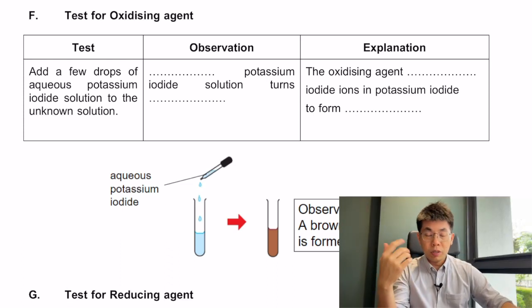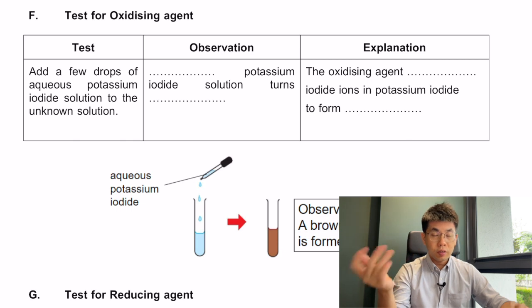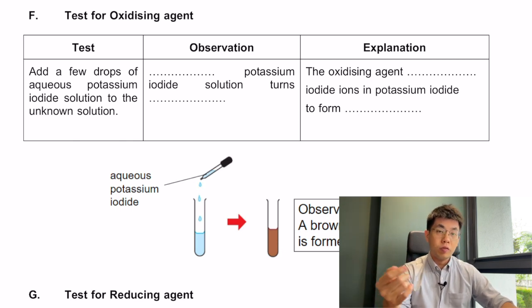Hi everyone, Mr. Benjamin here, and today we'll be talking about how to test for oxidizing agent and test for reducing agent. Okay, so these are two tests like your QA test that you need to know.